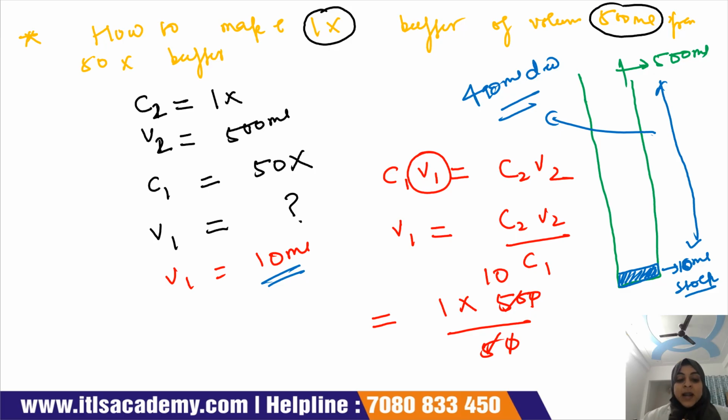So this is all about the solution preparation. Here we discussed molar solution, normal solution, percentage solution, stock solution, working solution, X solution, and along with it we also saw the conversion of percentage into molarity and molarity into percentage.